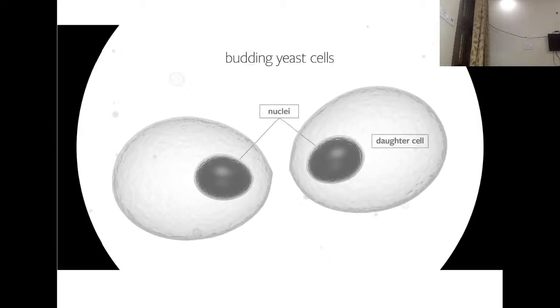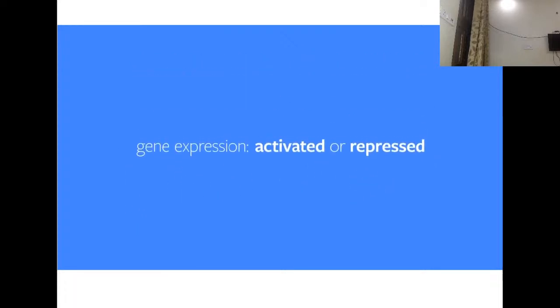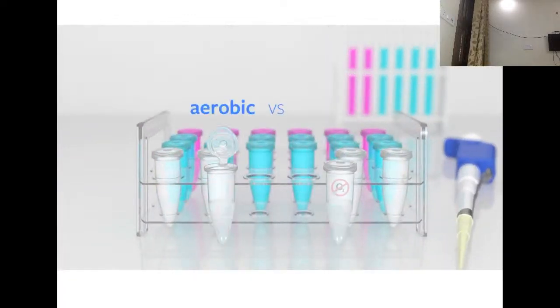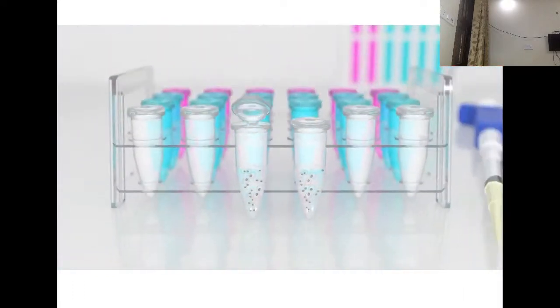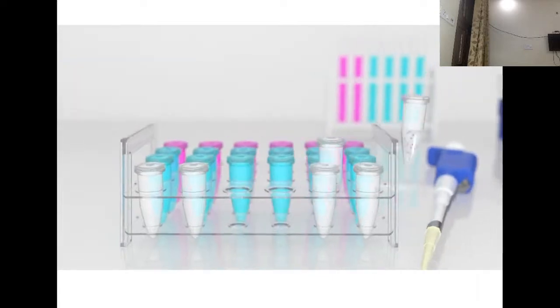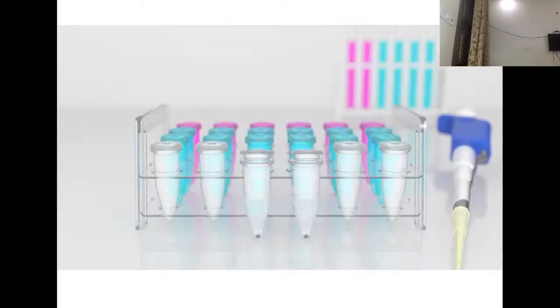One common use of microarrays is to determine which genes are activated and which are repressed when two populations of cells are compared. Every gene is measured simultaneously. As an example, we'll compare what happens to yeast genes when cells are grown in aerobic versus anaerobic conditions. The cells grow and adjust which genes need to be activated or repressed in order to survive. Now it is time to isolate the mRNA from both populations of cells. The cells are spun in a centrifuge. Now that the cells have gathered in pellets, we remove the liquid, but not the cells.